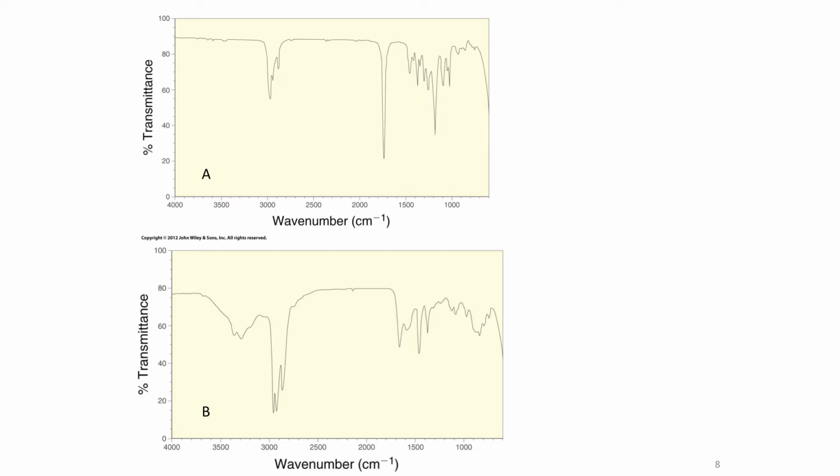As we read in the text, we can divide this spectrum into approximately 4 regions, and you can do that with your pen on any spectra that you want to analyze. This first region, from about 2700 on to 4000 wave numbers, are any bonds from heteroatoms to H. So CH bonds, OH bonds, and NH bonds will appear here in this large region at the left end of the spectrum.